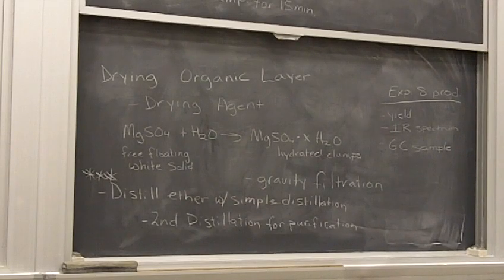So that's why it's really important you know the boiling point range so that you know that you're collecting your alcohol in the right range and you're collecting pure fractions of it, okay? So you'll probably collect from 20 degrees below to the boiling point range and then collect another fraction that's right at that boiling point range when it sits there, all right?